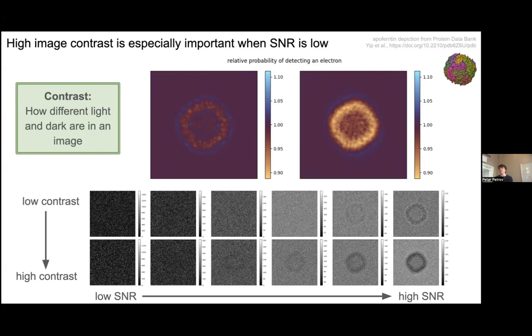I think I was going to ask you about the former, like how the electrons actually appear more probable to make the image. What is the main limiting factor? Right. And that's the matter. Yeah. So more matter is bad for us. Right. You're going to scatter off of more matter. You're going to deposit more energy into the sample, which also has those downstream effects.